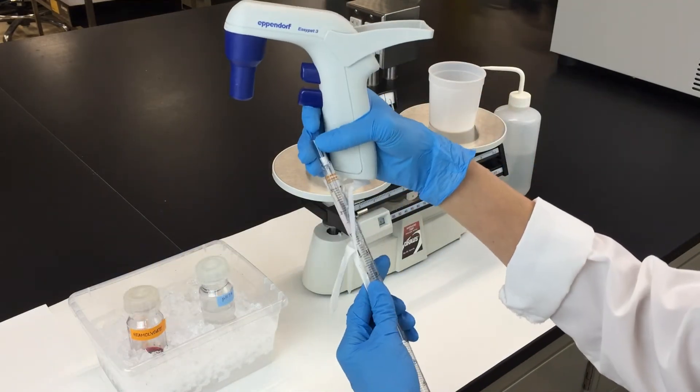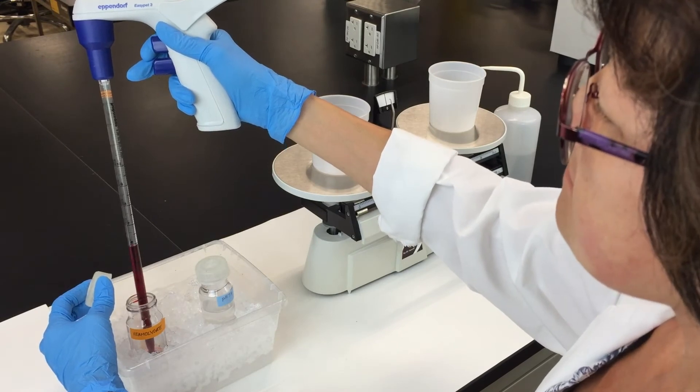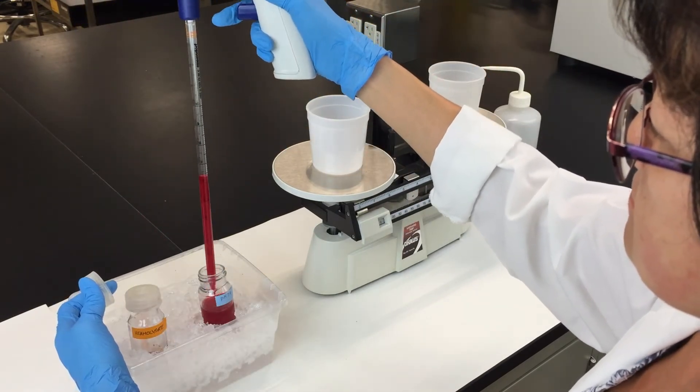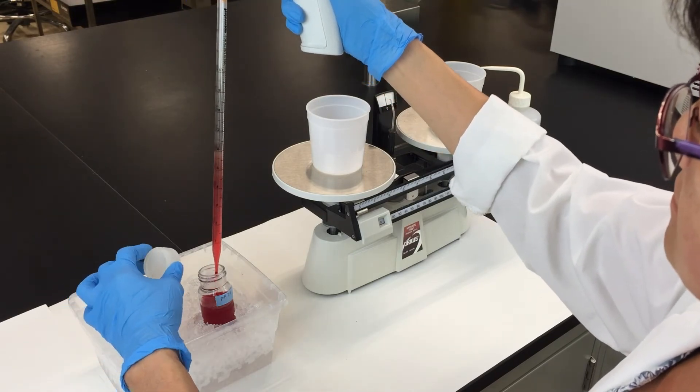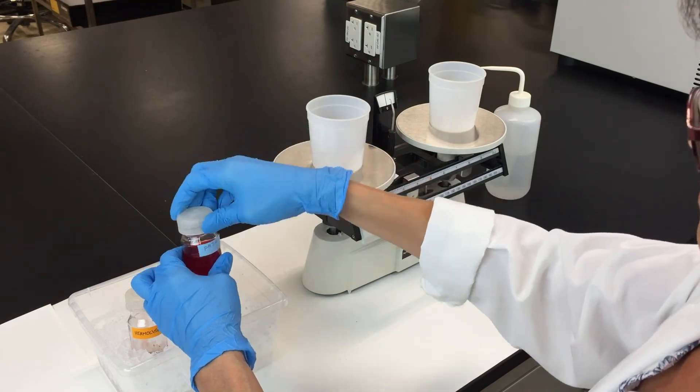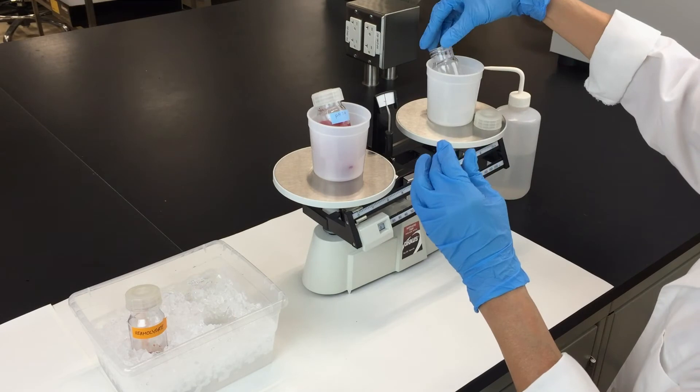Next, add 6 ml of the hemolysate to 45 ml of buffer. For this demonstration, we'll be using buffer pH'd at 7.4. Balance the tube and put it in the centrifuge for another spin.